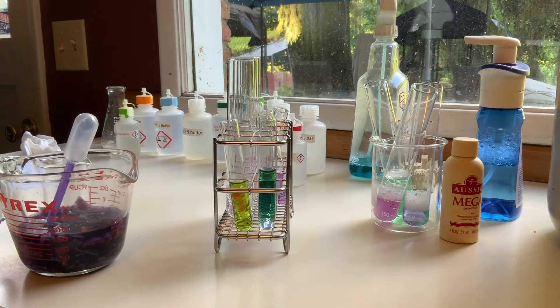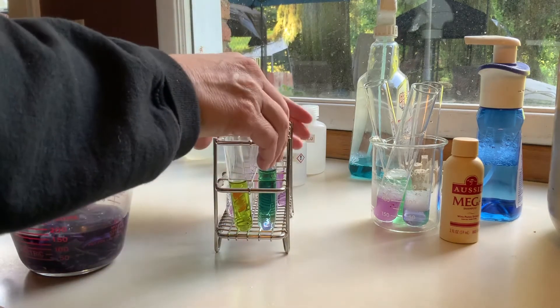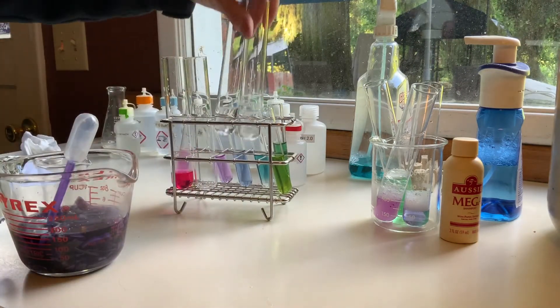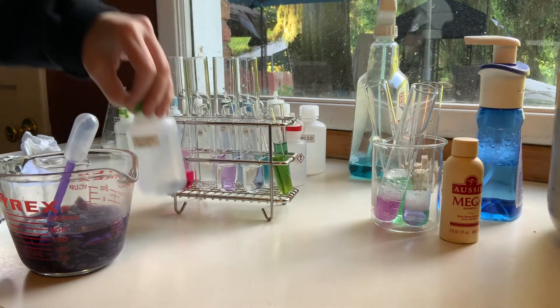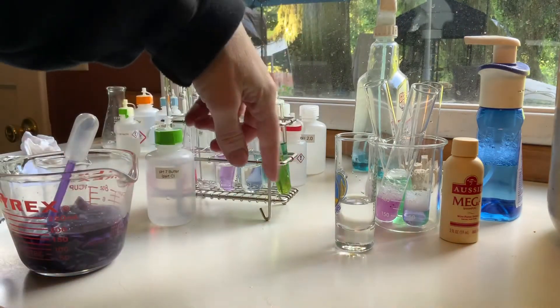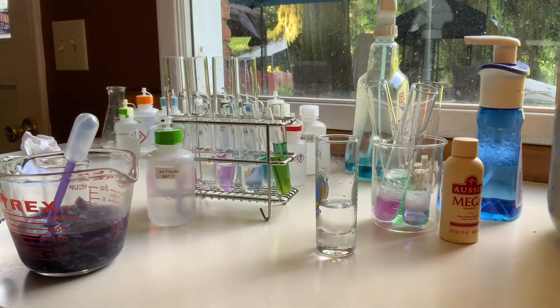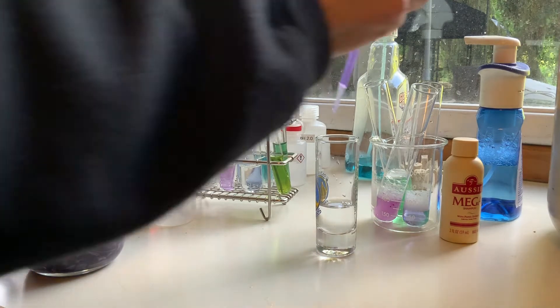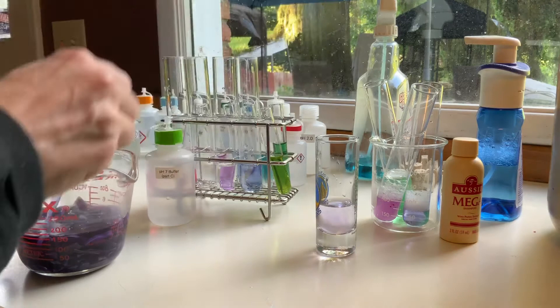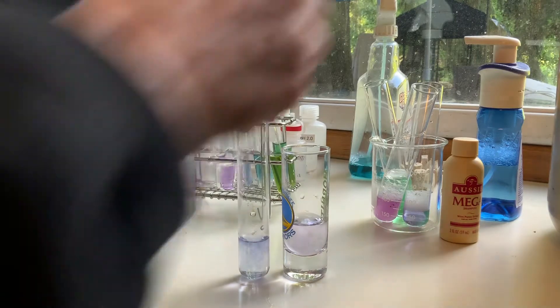Now in the third part we're going to take a look at the difference between buffers. So now we're looking at these two — these are both buffers with a pH of 7. I'm going to compare one of those to one of these glasses, which just has water in it. And then we're going to add a cabbage indicator to both of those. They're not identical, but they're similar.